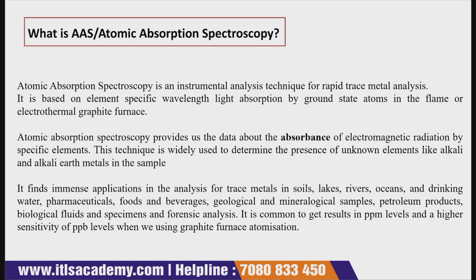or electrothermal graphite furnace. So atomic absorption spectroscopy provides us with data on the absorbance of electromagnetic radiation by specific elements, meaning how the electromagnetic radiation is absorbed by a specific element.